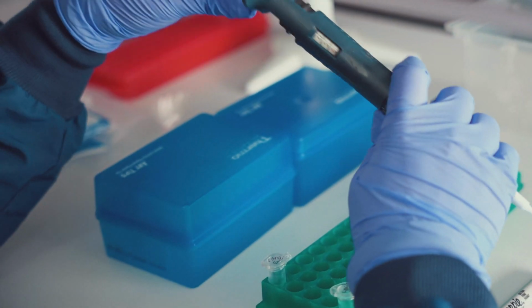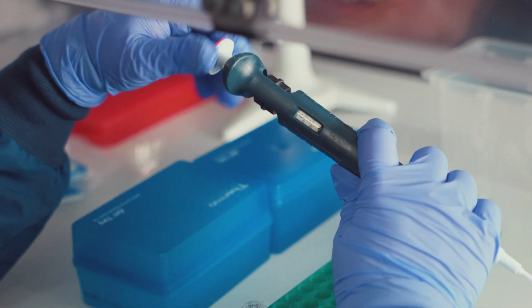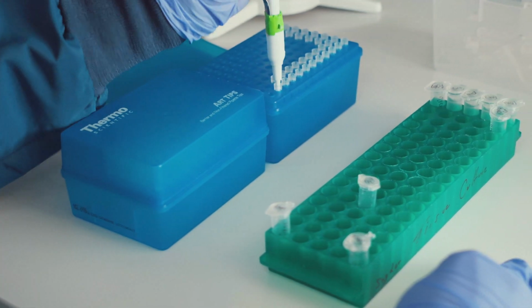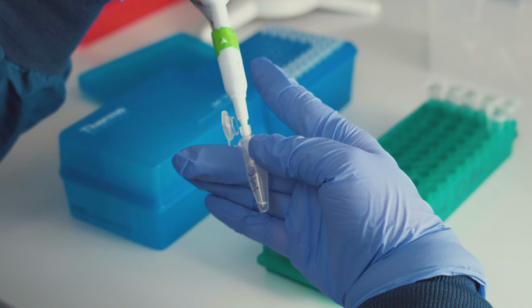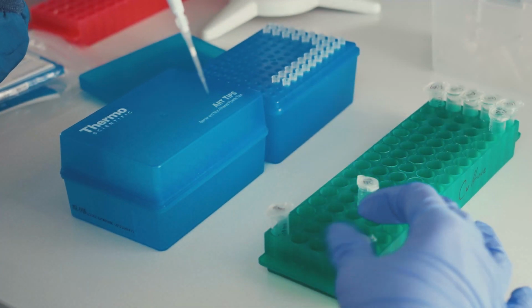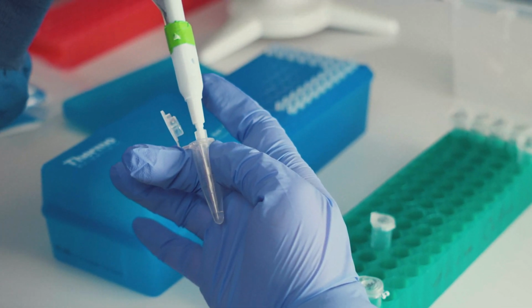Next, you're going to put the allotted DNA into your TE buffer. Obtain the appropriate volume for your stock solution. For this, you also want to get to the nearest decimal possible. When you obtain your stock solution, you want to make sure that you do not obtain any air bubbles. You're going to place that stock solution into your pre-labeled tube containing your TE buffer.